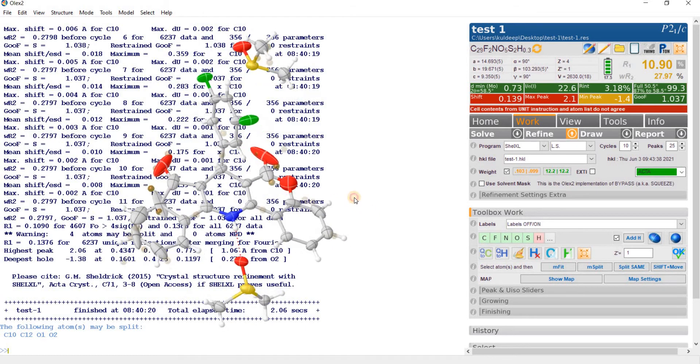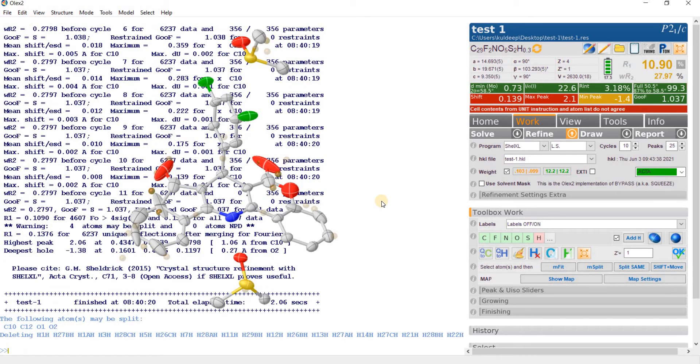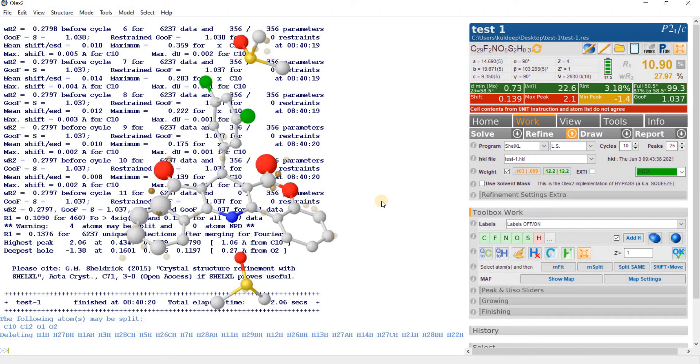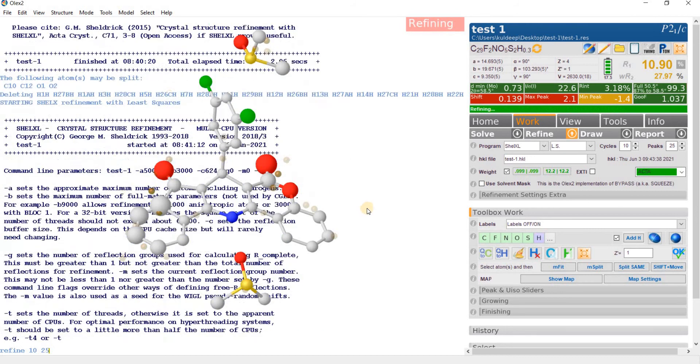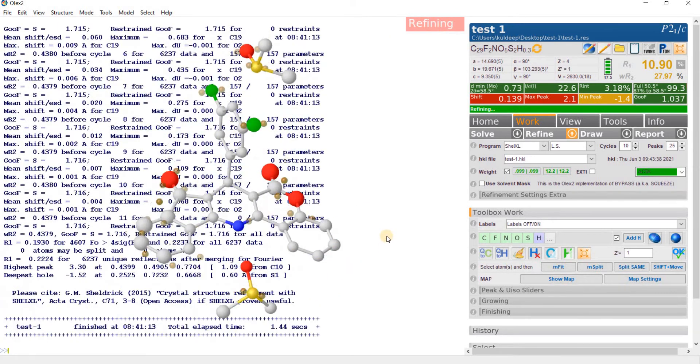How to resolve this disorder? Go back, select all the hydrogen and just delete them. Then go to the isotropic model and refine 4 cycle and 25 Q peaks. So we are again getting the isotropic model.